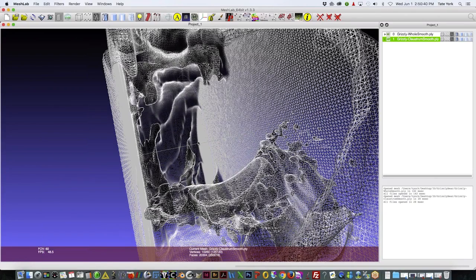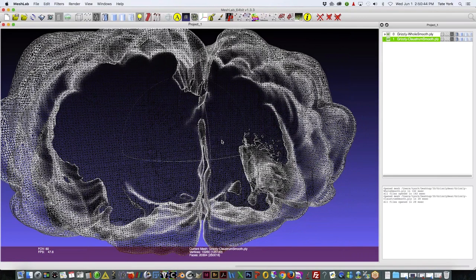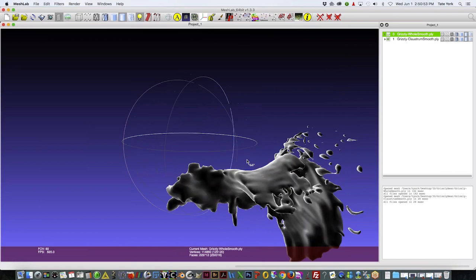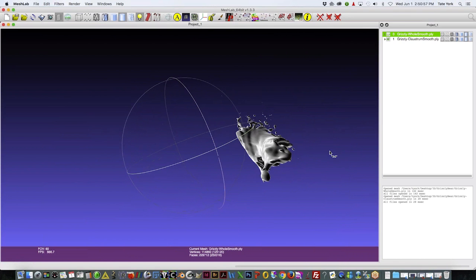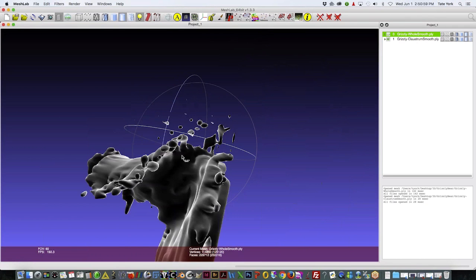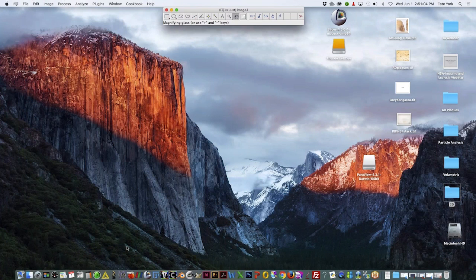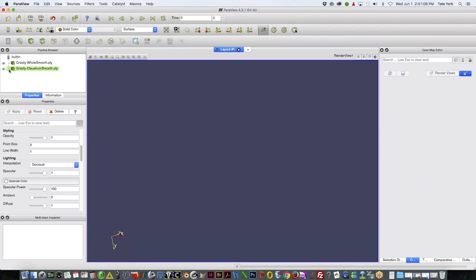So what we have here is that same slab. We change the opacity, and right now there's nothing there. It's an empty shell of a brain. But I've got the claustrum uploaded up here. So now you can see the structure even better. And again, if you wanted to look at one versus the other, you can do that as well.